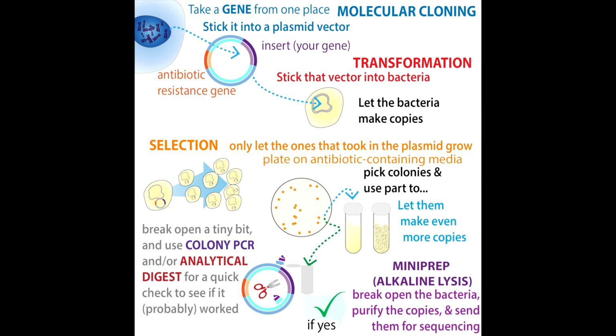Usually we do this with heat shock. Basically we take weakened bacterial cells that are made chemically competent. What this means is we weaken them so that when we use heat shock, so we stick them in a warm water bath for about 40 seconds, pores will open up in the surface of the bacteria.